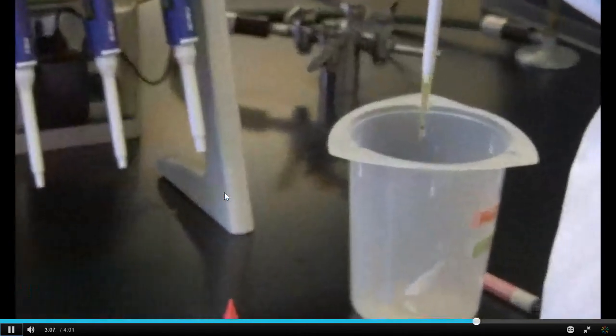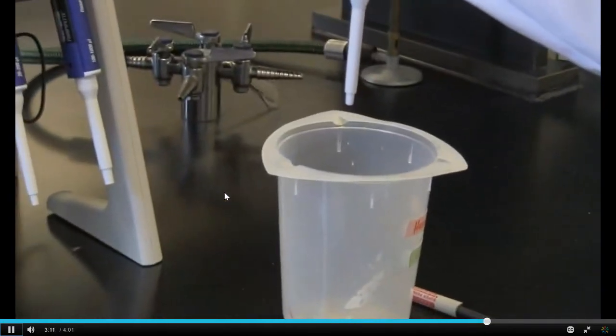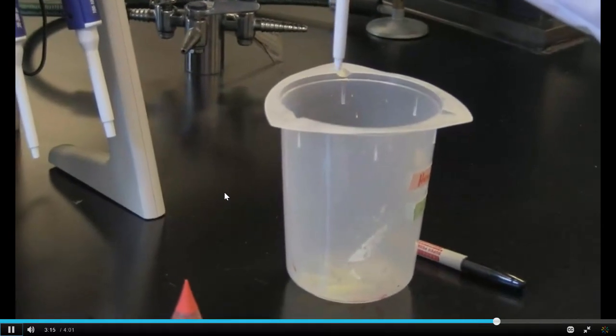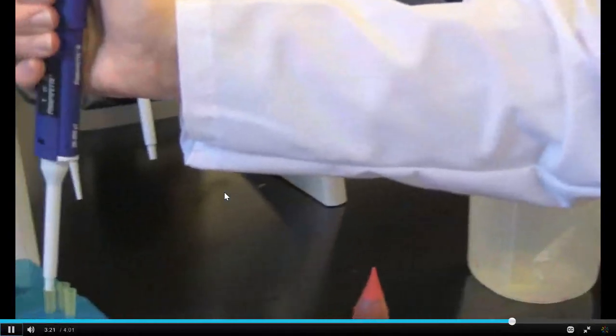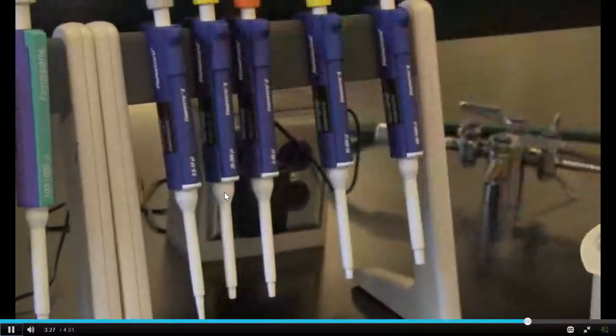You can now eject the tip into the waste receptacle by pressing on the tip ejector. You may want to limit the number of tips available to students to discourage wasteful tip ejection. It is important to change your tip when changing solutions. Place the micropipette back on the stand when finished working with it.